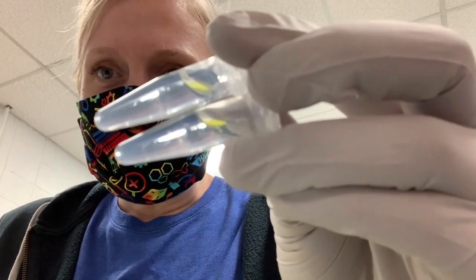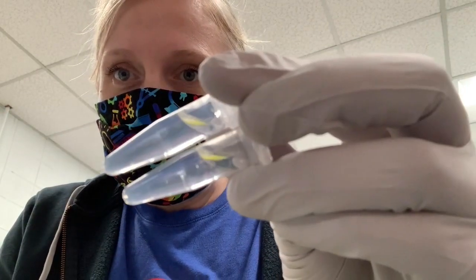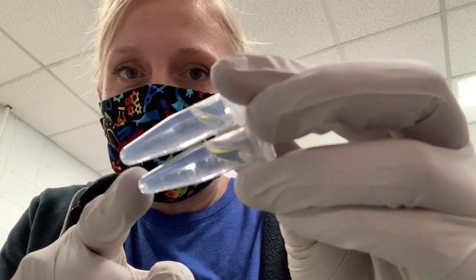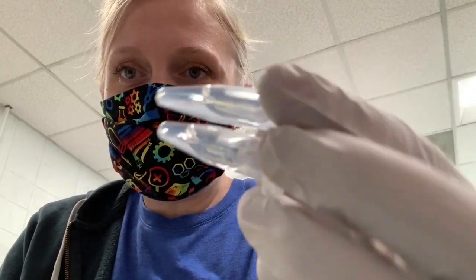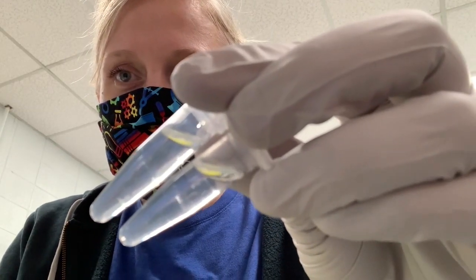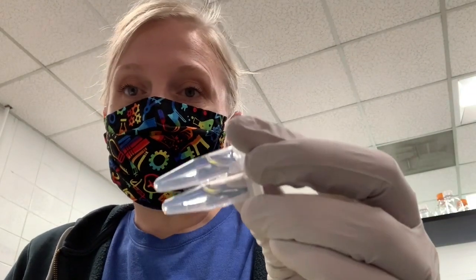If you invert your tubes, you can see, I noticed it in this one, some chunky, clear material moving around. I can notice it again in that one. And that's the precipitated RNA. So I'm going to pause the video so that I can add these reagents to the other tubes, and then we'll put these tubes in the freezer together.